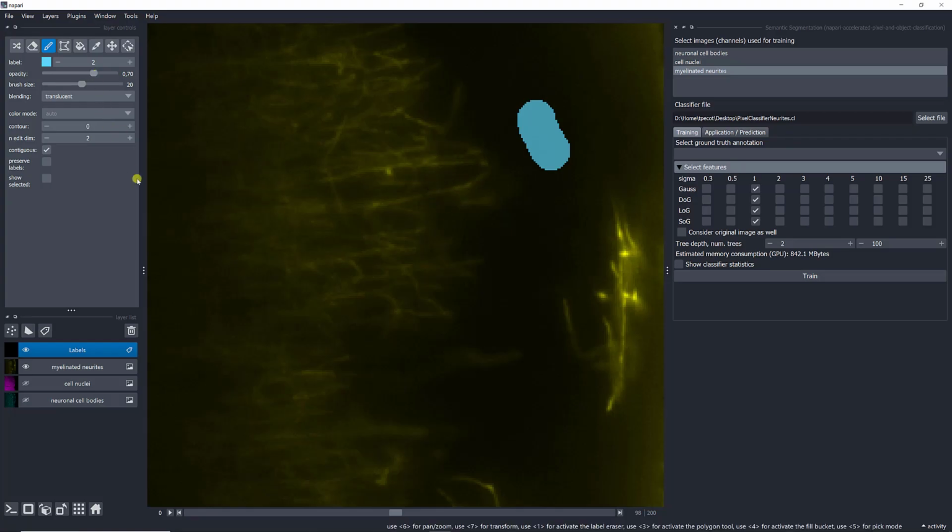So I'm going to remove this. And as I said, it's very important to have a good brush size. Whenever you do machine learning based on what we call shallow machine learning, old-time traditional machine learning, it's very important to show examples by using something like this.